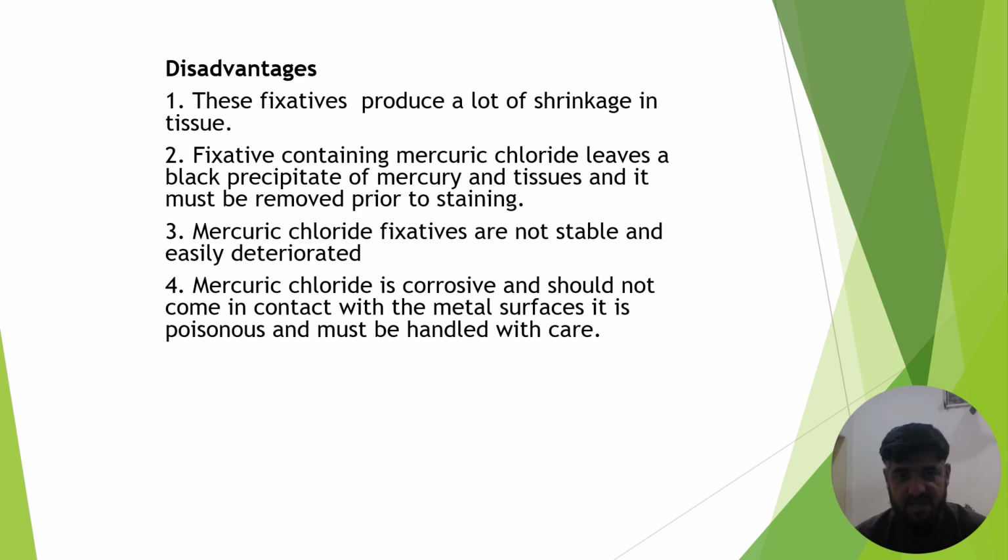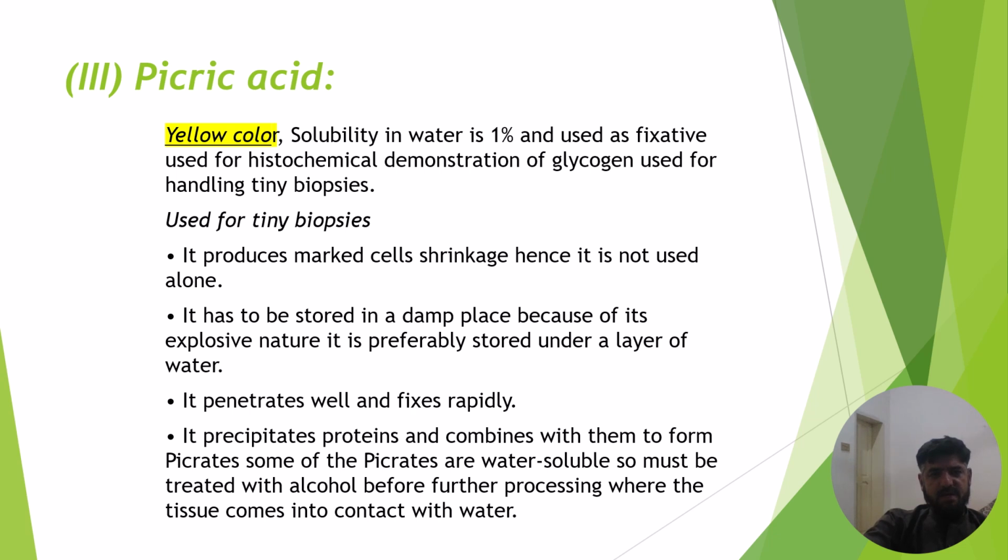It is poisonous and must be handled with care. So picric acid is also one of the simple fixatives. It is yellow in color. Its solubility in water is 1% and it is used as a fixative for histochemical demonstration of glycogen. It is also used for handling tiny biopsies.